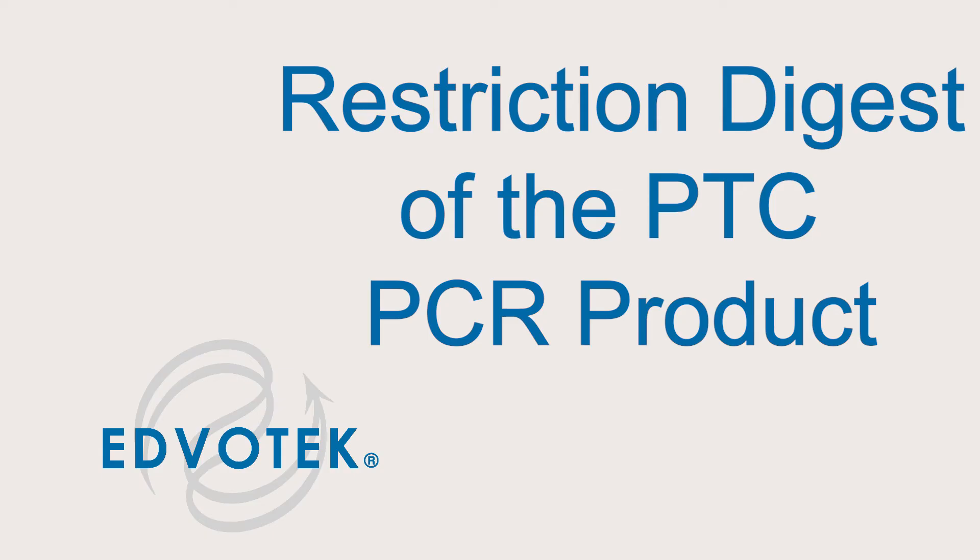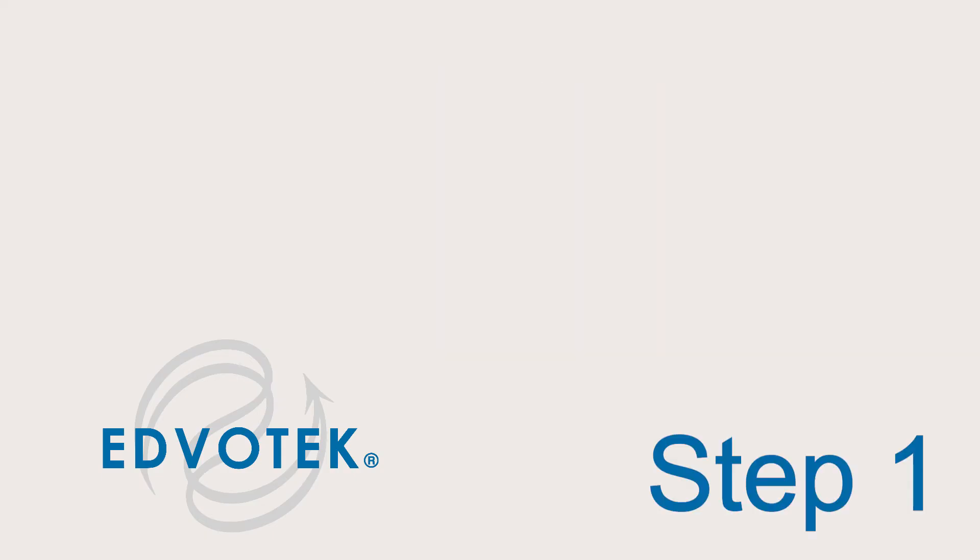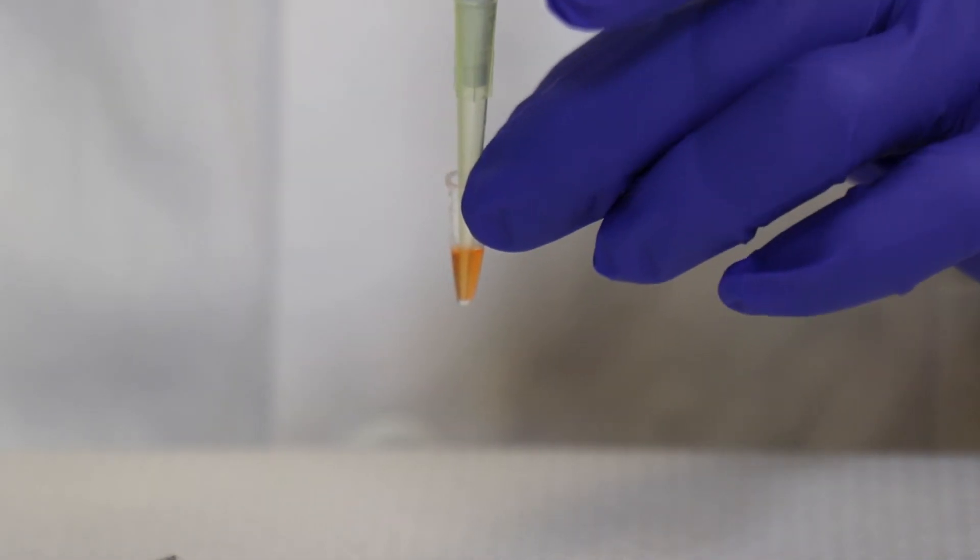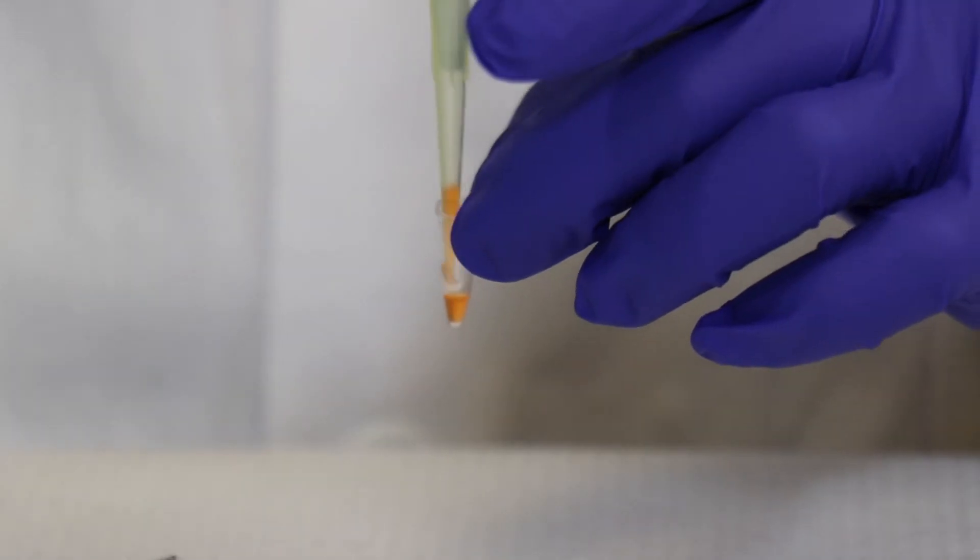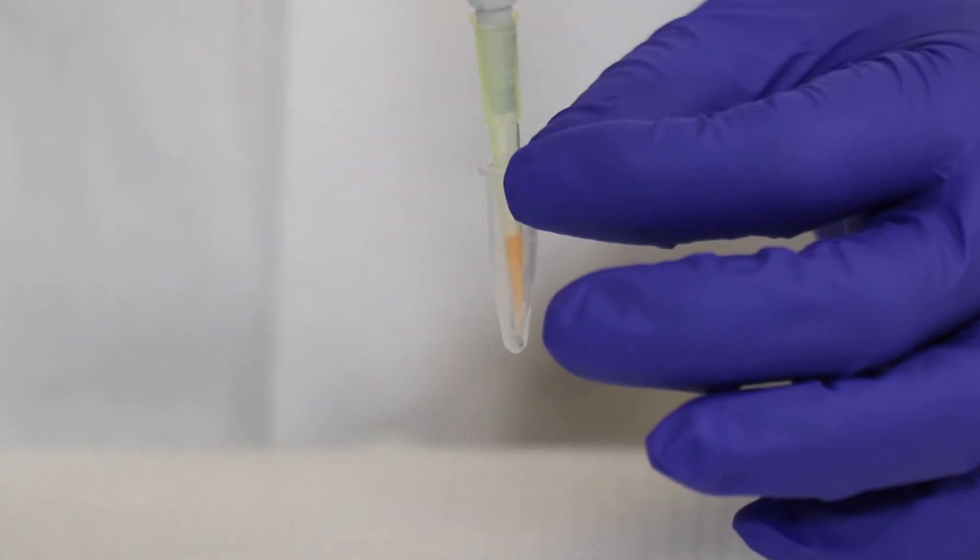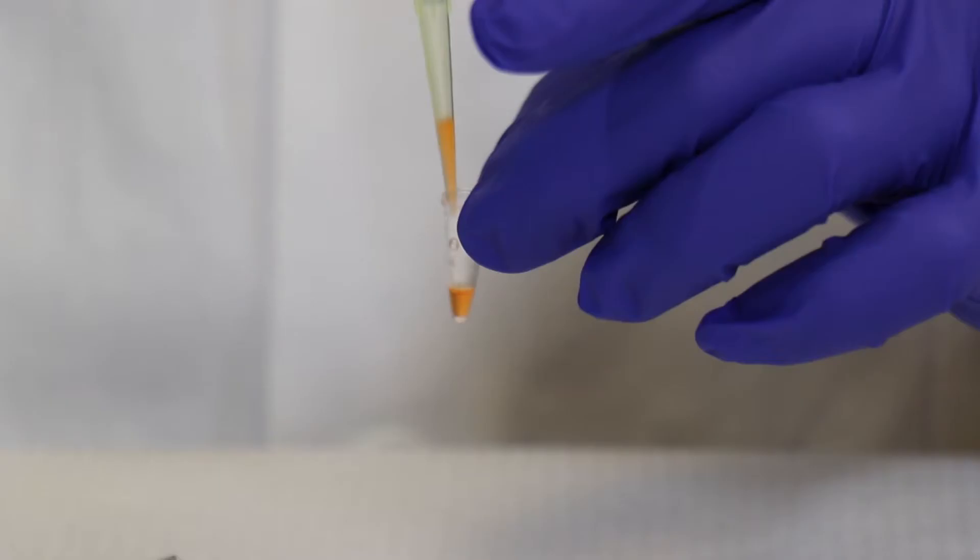Module 3: Restriction Digest of the PTC PCR Product. Step 1: Add 25 microliters of PCR amplified DNA to the tube containing 5 microliters of Hae3 restriction enzyme. Save the remaining 25 microliters of uncut PCR product to set up as a control later on.